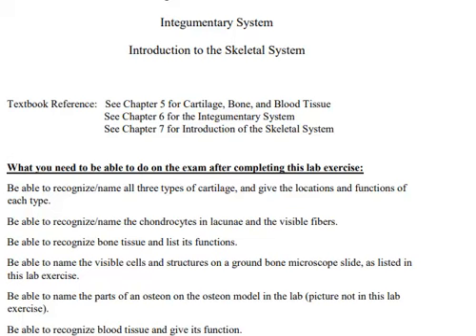And then you're supposed to be able to look at a microscope slide of bone and name all the parts on the microscope slide. And then you have to tell the parts of an osteon. So let's do that part, and then we'll get into the blood and the skin.